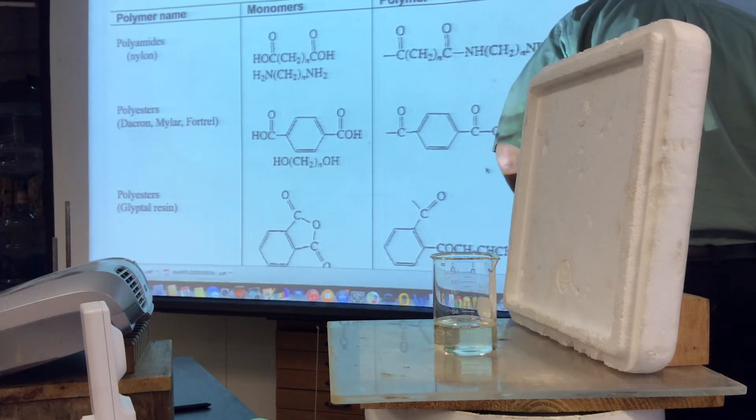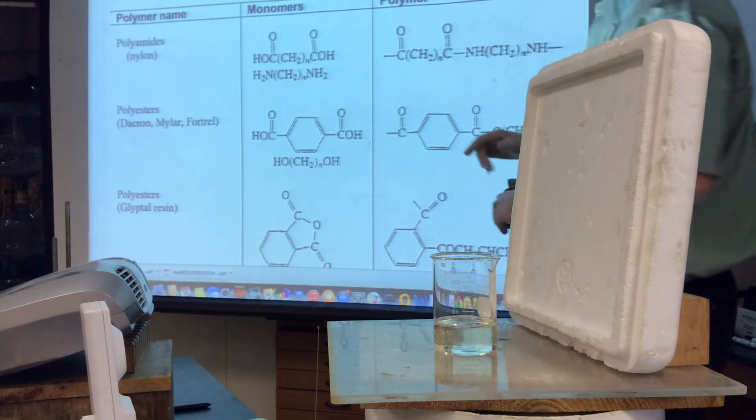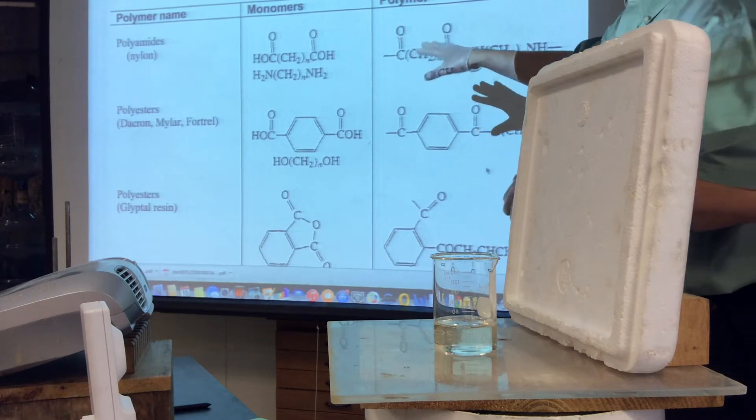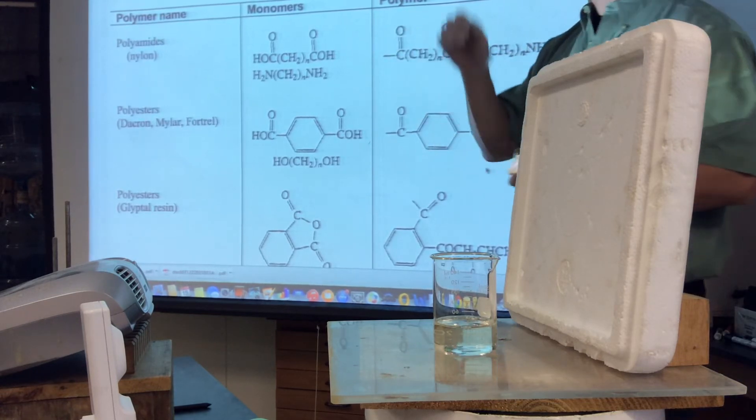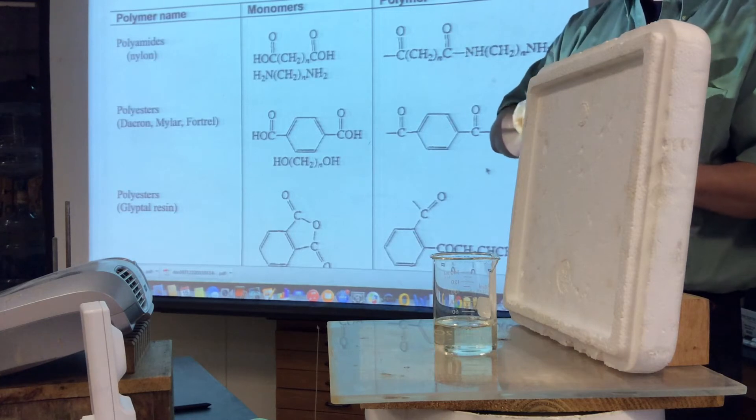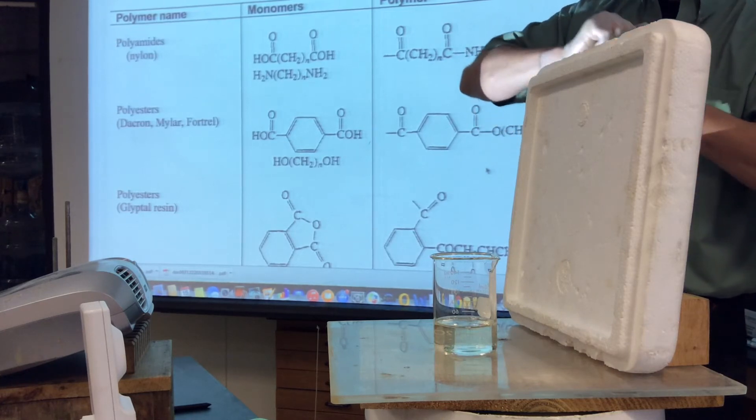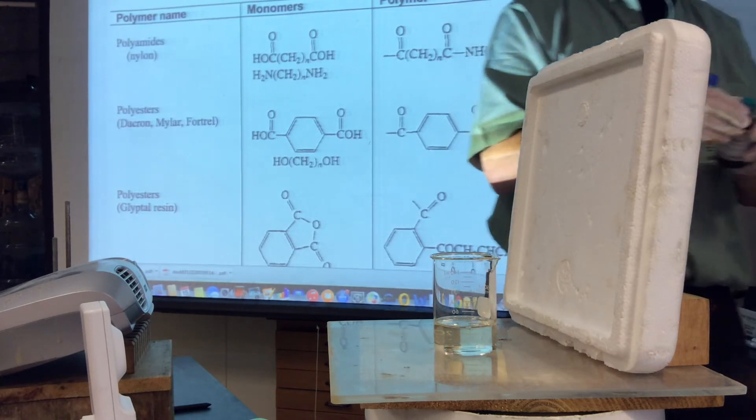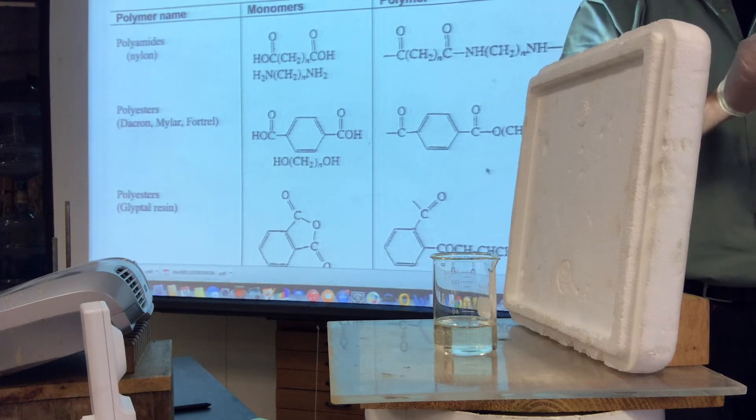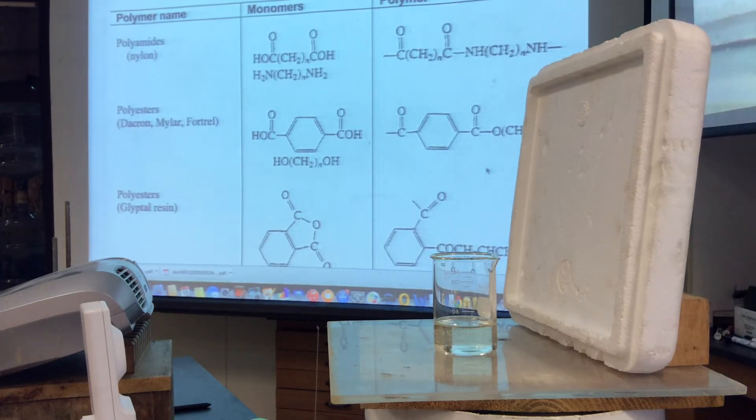Now I'm going to add some adipoyl chloride. Again, the combination of these two will make the polymer. It's how I make the polymer in this demo. It's pretty interesting, though. This one, of course, I have to open. It's a fresh bottle. So this one, these definitely have two densities. But what's really cool about this demo is that once I open this bottle up, what's cool is to watch the actual length of the polymer appear in front of your eyes from the two liquids.